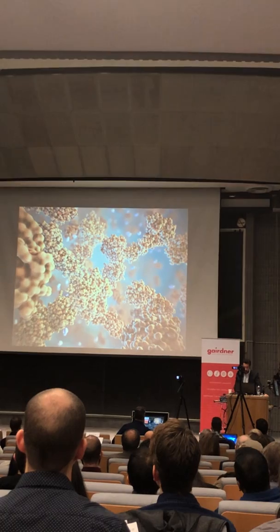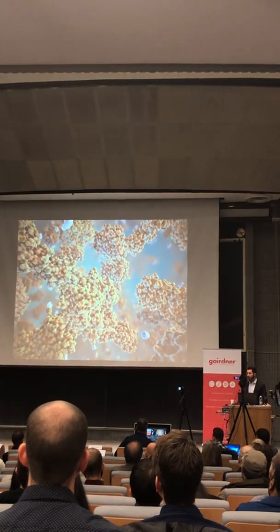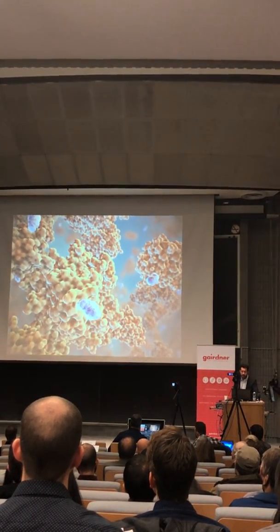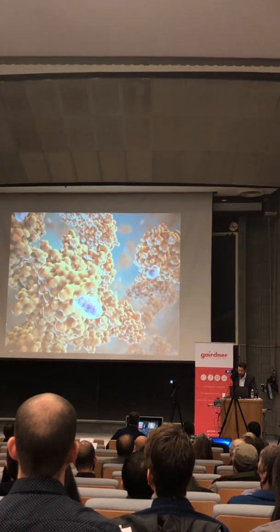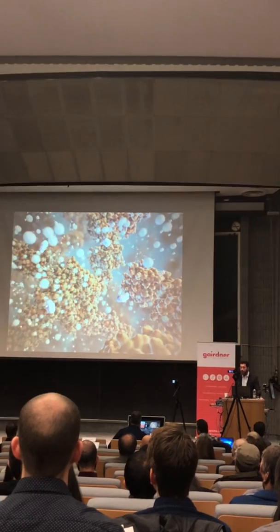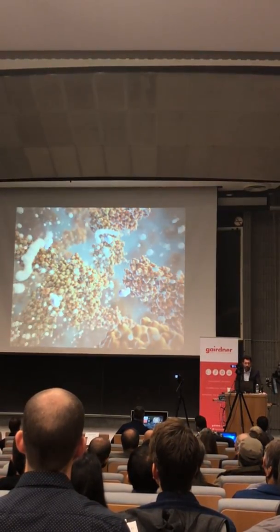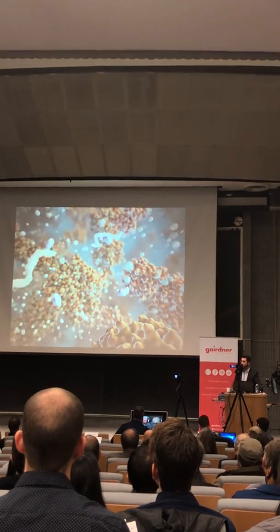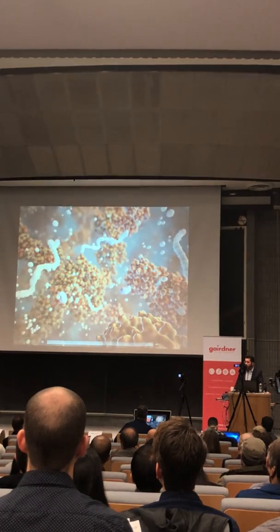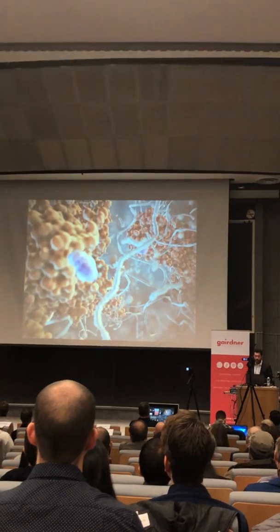So to do that, we had to make a couple chemistries work. We had to develop anchoring molecules that could bind to DNA and RNA and proteins so they could be pulled apart. And we also developed ways of doing this with labels such as antibodies and other applied labels such as fluorescent proteins. Then we can form the polymers, and this uses a recipe that really combines the 1980 and 1981 papers I mentioned earlier. We're doing free radical polymerization that allows us to create these polymer threads throughout the tissue, and when the growing polymer threads encounter the anchor, they will bind. And that is shown in this cartoon here.